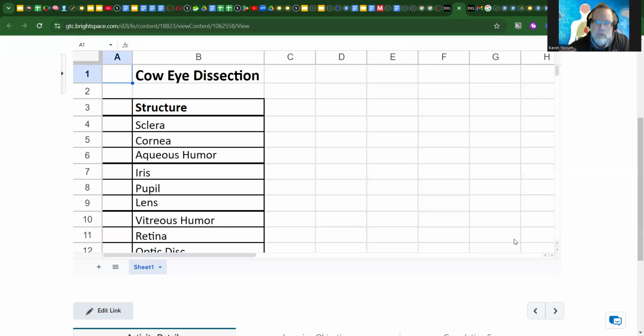As you're getting rid of the musculature around the eyeball, you're going to notice a cream, whitish, solid tube coming out of the back of the eyeball. When you get your eyeball, you'll see the cornea will be present, and you'll also notice the sclera. The muscles surround the majority of the eye, but you will notice a distinct window that is the cornea.